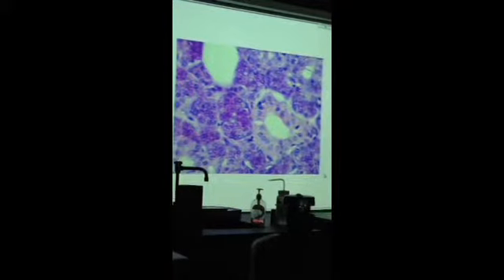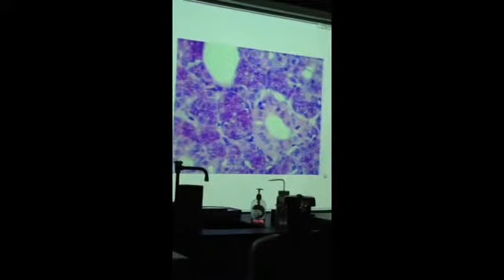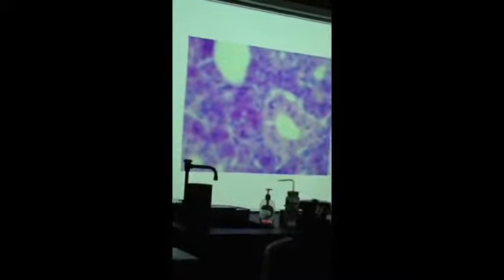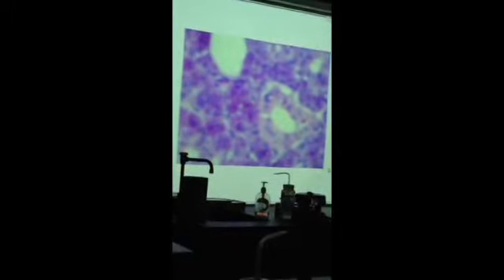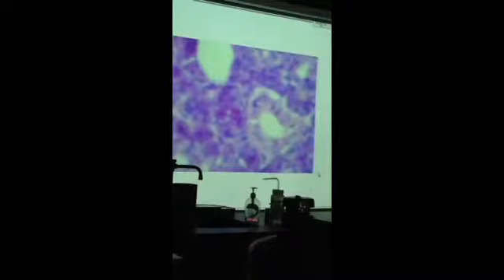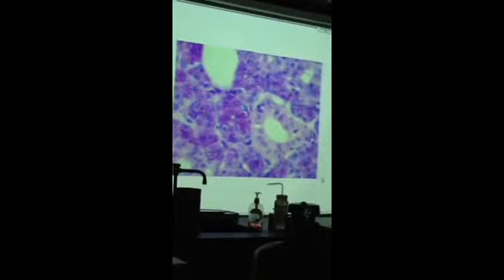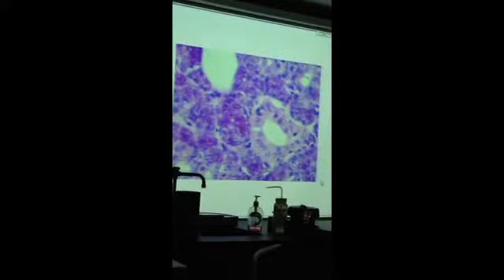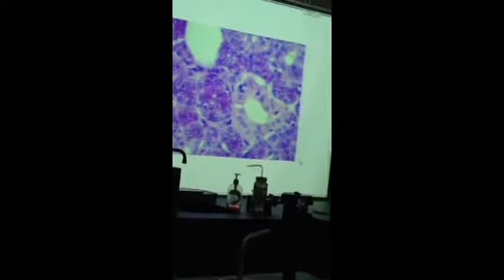Now getting back to what I had before, what is this thing up here? Is it a tear in the tissue? What do we have all over our body? Adipose. This is fat. And the fat cells are the adipocytes. They tend to just look like empty spaces. In life they're full of fat droplets that get leached out when you fix and stain the tissue, so they just look like a big empty space. So that's adipose. Again, these are serous cells around here, darker purple stained ones.